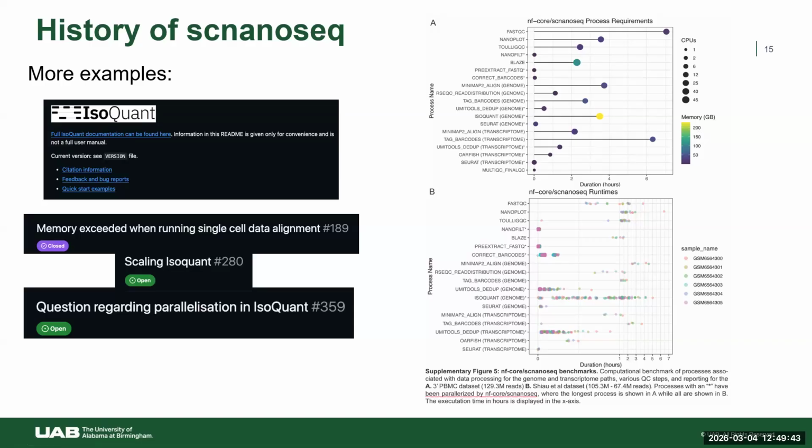If anything, I'm worried about both things, the CPUs, but also the memory, right? Not everybody has access to that much memory. And even if you're at UAB, you're competing against yourself, so to speak, because if you're submitting like, I don't know, 20, 30 samples, that's a lot of memory. So it was very clear that this was a gap in this particular method. That is why we've actively communicated with the authors the need for that improvement, and it does seem like they have done some milestones towards that. We're going to be revisiting this very soon.